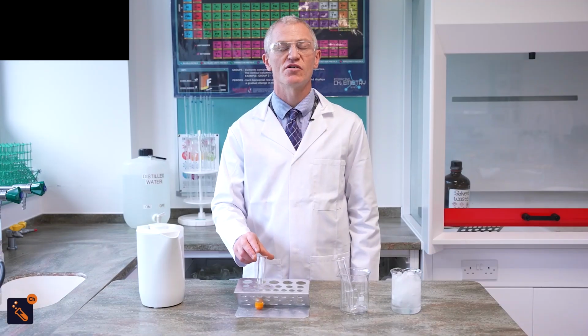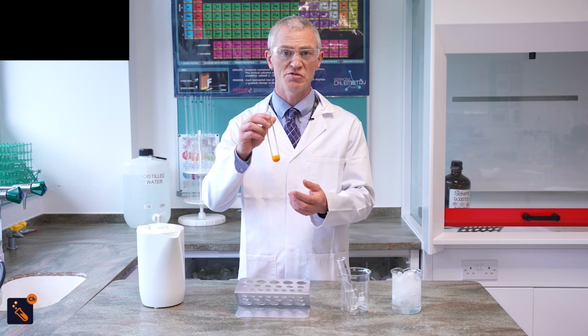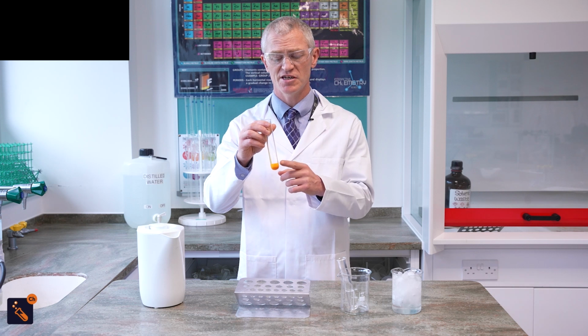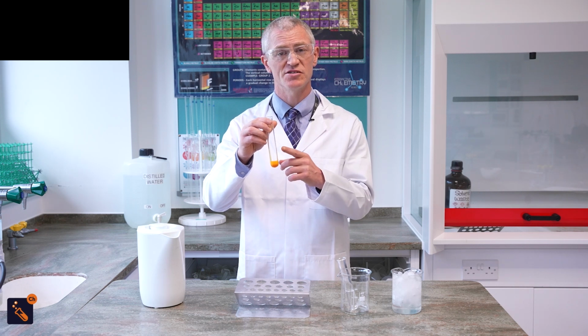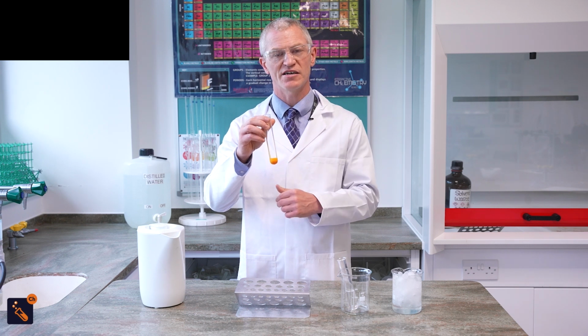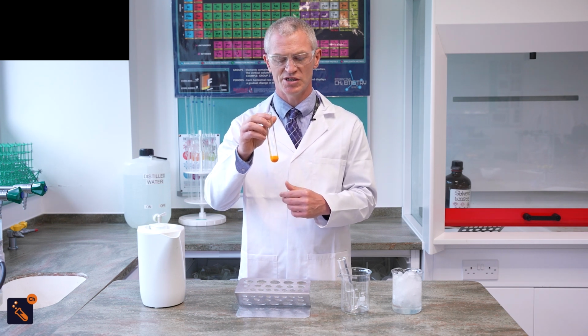We're now going to do recrystallization. You have to describe this in your exams, so it's really important you understand. Here we have our 2,4-DNPH derivative. This is the ketone or aldehyde that has reacted with your 2,4-DNPH.